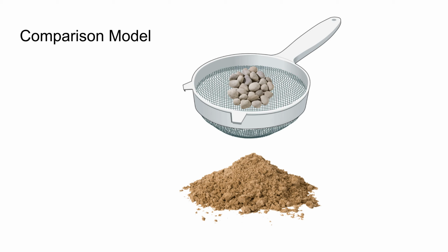And in the mass spectrometer, this also applies as the electric field will separate the compounds based on their mass. So as you can see, the smaller grains of sand are separated from the larger ones, which is comparable to the magnetic field bending the paths of the fragments to a certain degree.